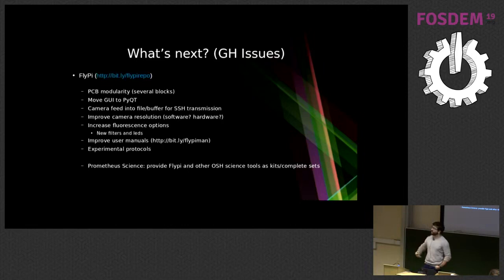Right now we're down to 10 micrometers, but we hope that by either changing software or hardware we can go down. And so by going down we can do even more diagnostics and even more experiments that we're currently not able to do. So for instance, at the moment we're not able to detect malaria with this because the parasites are too small for the resolution of the camera.